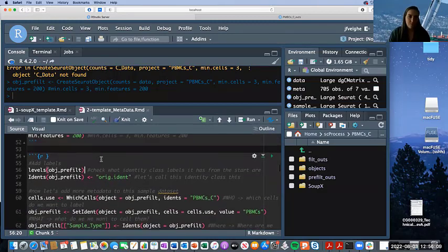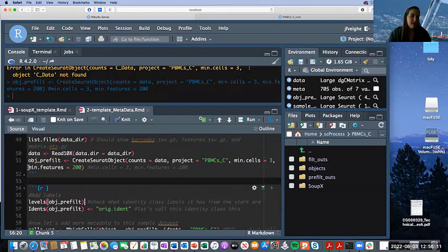Okay. The min features means min genes. Yeah, so it's going to bring in cells that have at least 200 different genes. And then min cells will bring in genes that are in at least 3 different cells. Okay. Do you ever get a gene in just one cell? I haven't looked for one per se. Lowly expressed things. Well, if that's the case, then it's probably not a gene that's expressed in 1 cell. Could be an error. No, just if it's lowly expressed, because you're sampling, you could get 1 read in 1 cell.